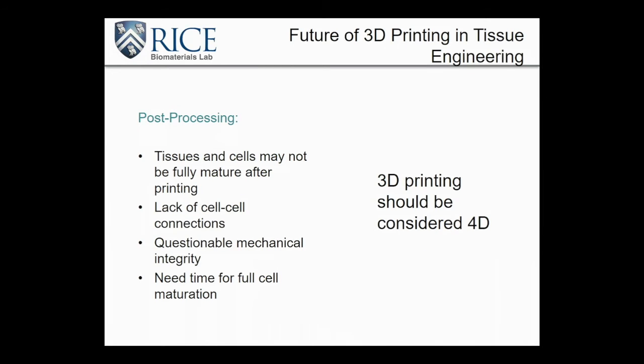So in concluding this discussion on these different bioprinting techniques, it's really important that we also consider not just what happens during the printing process, but what happens after printing.